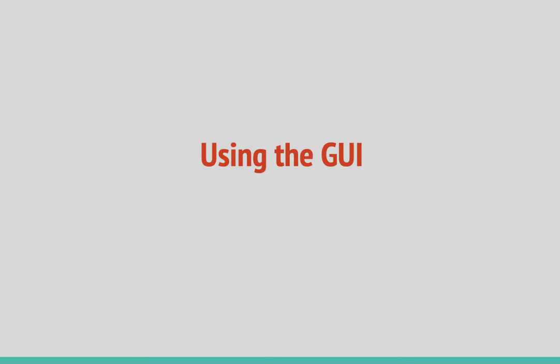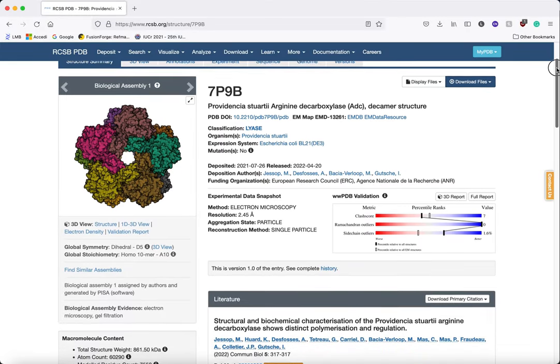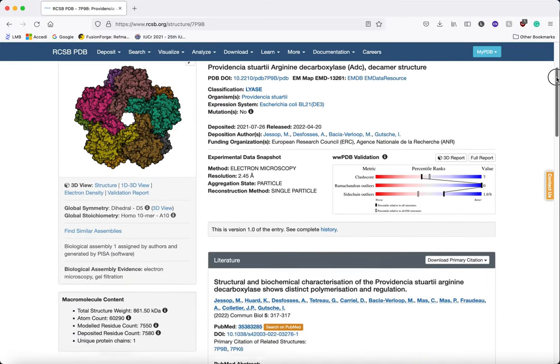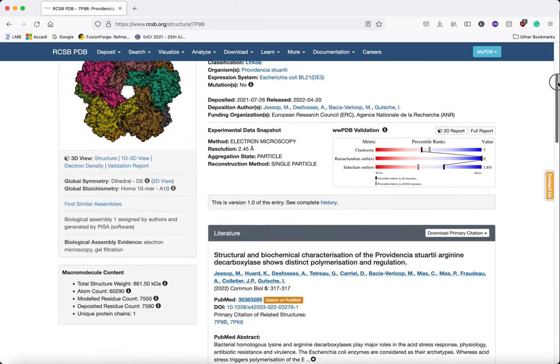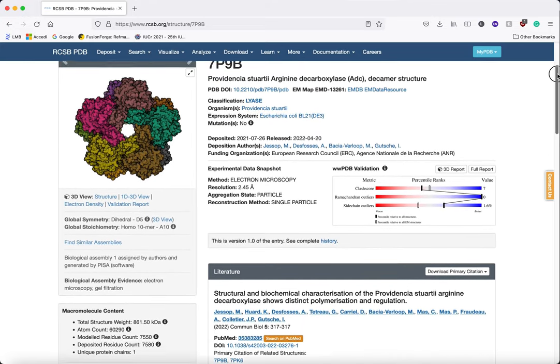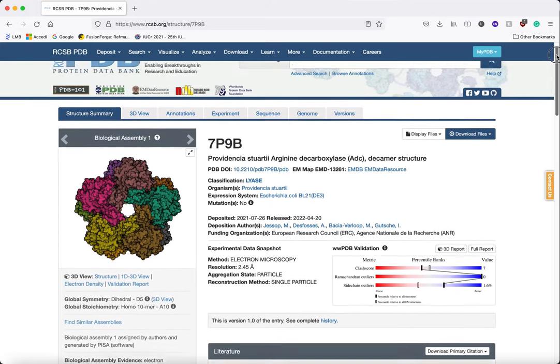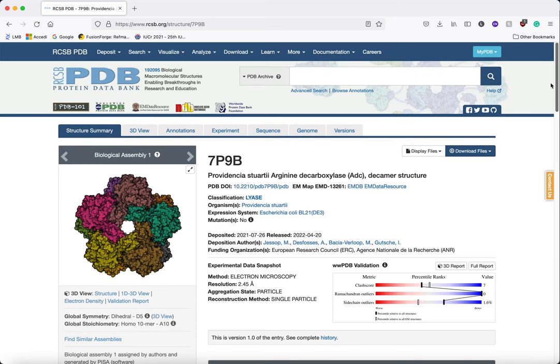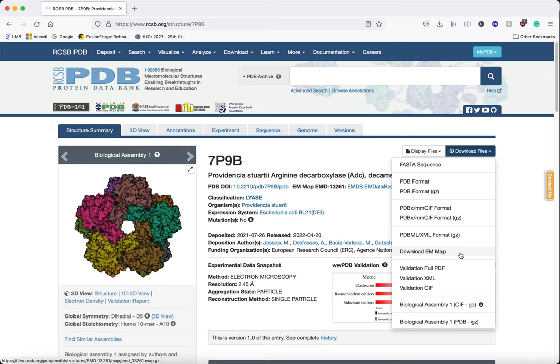In this tutorial we are going to use 7p9b, which is the PDB code for an enzyme called arginine decarboxylase, solved by CryoEM. So we are going to download the EM map, because actually Coot does not fetch the EM map, so we are going to download it from PDB.